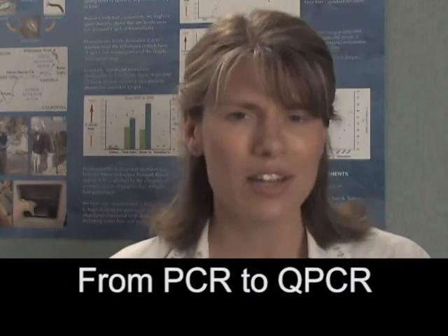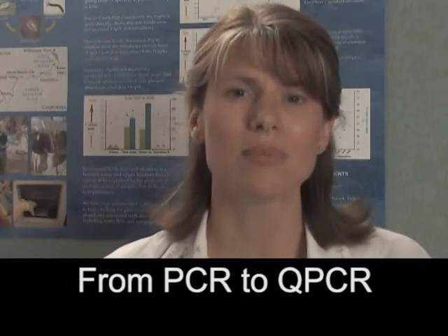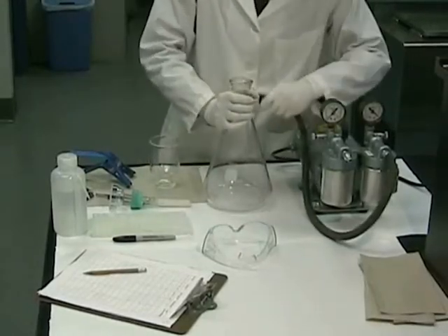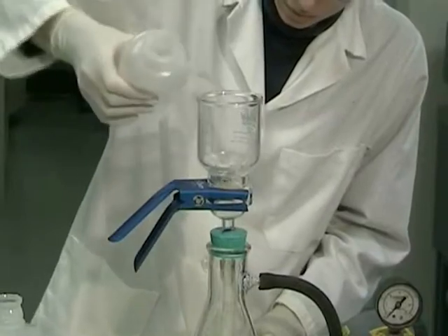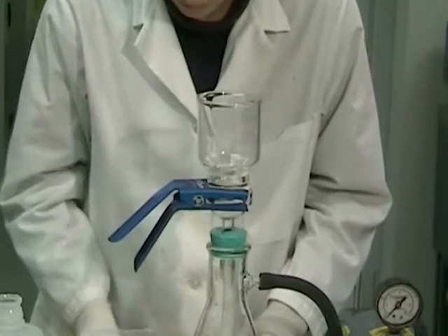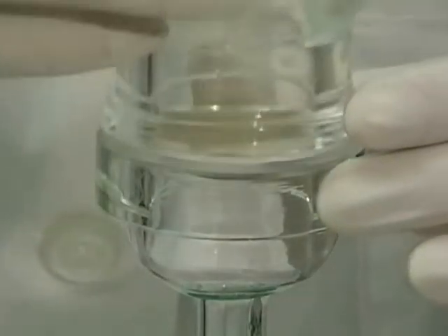There are many different pathogens in stream water, and we wanted to target just C. shasta. So I developed a quantitative PCR or QPCR to detect and measure specifically C. shasta. To filter the samples, we use a vacuum pump, and this helps force the water through a filter paper. The filter paper has lots of pores in it that are only 5 microns across, so it'll catch or capture all the actinospores and myxospores that might be present in the water.